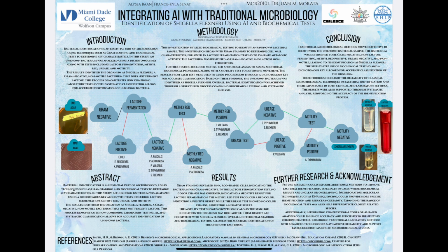Based on these findings, the unknown bacteria was identified as Shigella flexneri. Overall, bacteria identification was achieved through a structured process combining biochemical testing and systematic analysis.